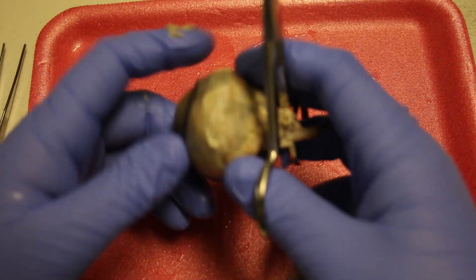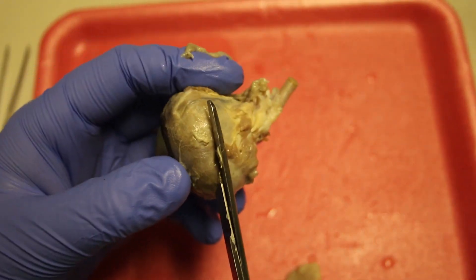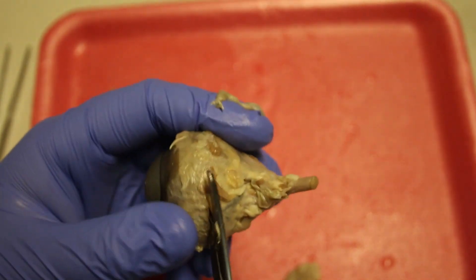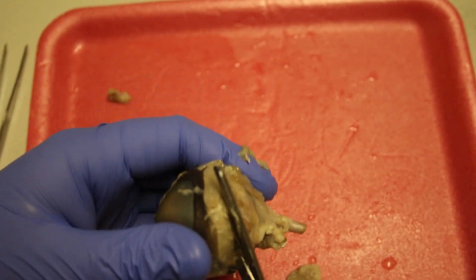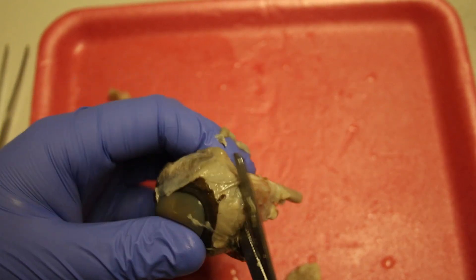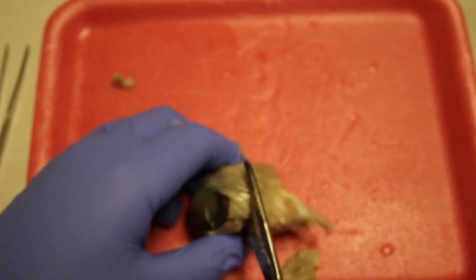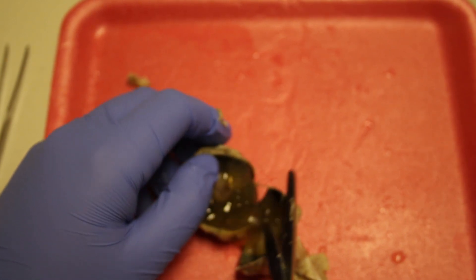When you're doing this, make sure not to put too much pressure on the eyeball itself. The sclera is fairly thick, so cutting all the way around will take some time. And there we go — we are in.